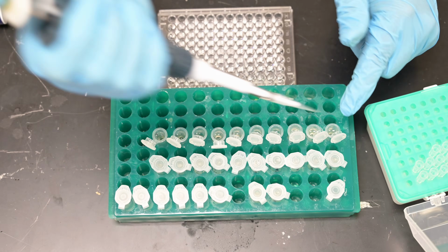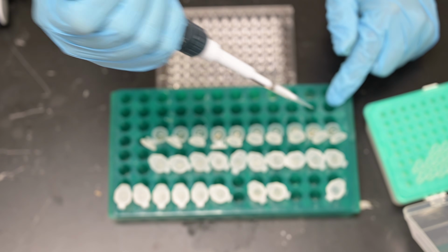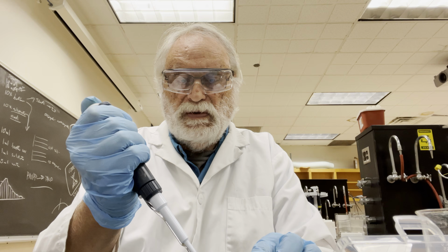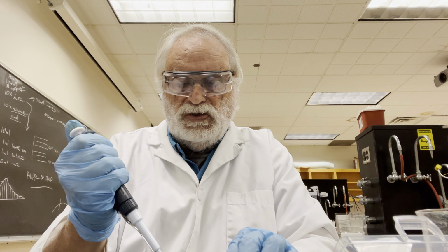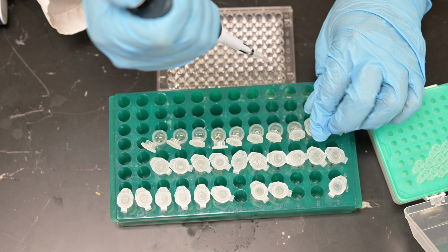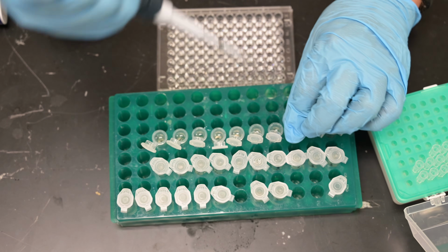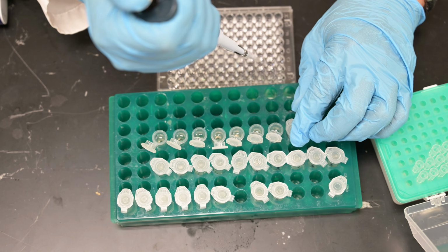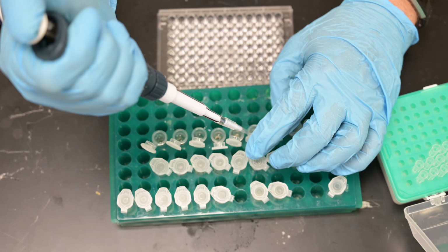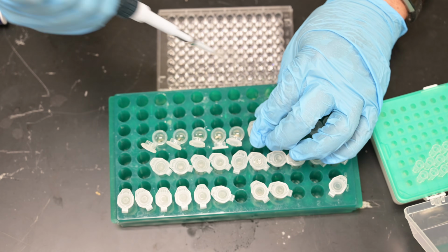And so all these go into row C. So for the 0.3 molar elution, tube number 1 goes into C1, 2 goes into C2, 3 goes into C3, 4 goes into C4, and 5 goes into C5.